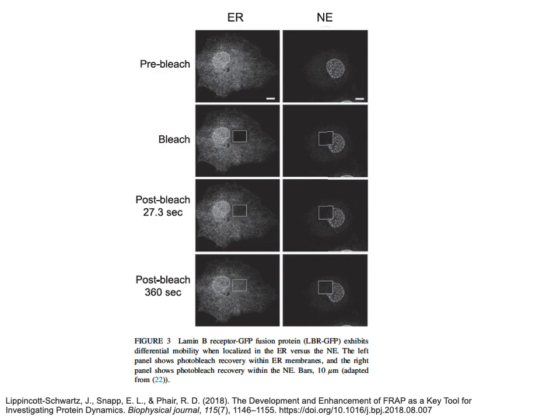And then we have a 360 second post-bleaching. Okay, so a short time and then a longer time. And so when we look at the ER, we can see that window, that square that's bleached, we start to get some recovery at the 27-second mark, but by the time we have the 360 second mark, it appears to be a full recovery.